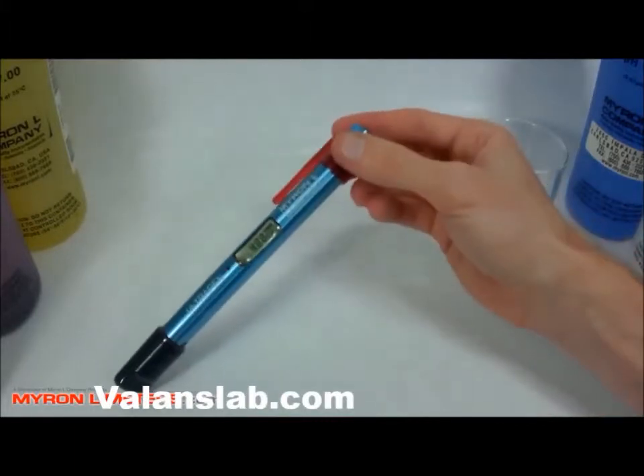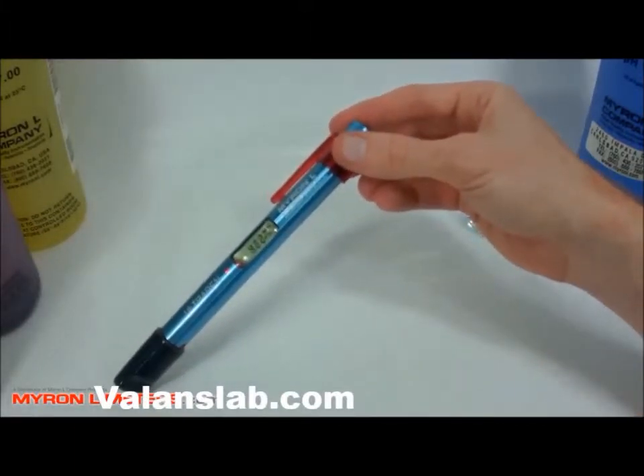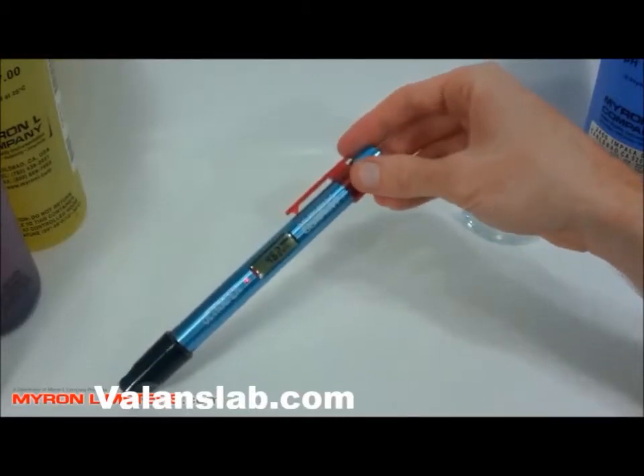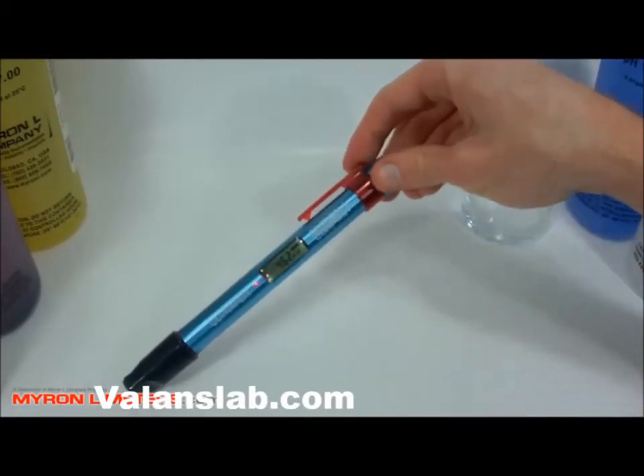And that's pretty much how you take a sample with the Myron L Ultrapen PT2 and go through the different steps, options, and calibration.